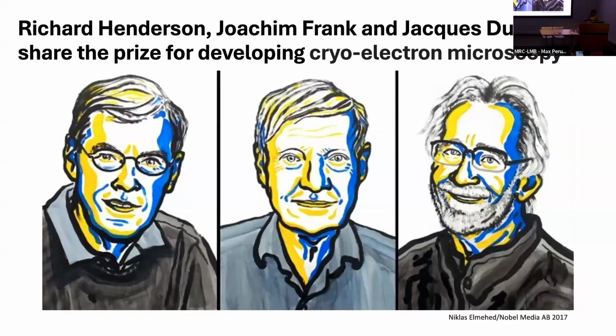Nobody uses contact film because everyone uses digital. The scientific application is the last to use film. From 2013, cryo-EM came. There are a few cameras underneath, but we do not use them now because the detector already has a higher DQE than the film. So this is what the revolution was for.